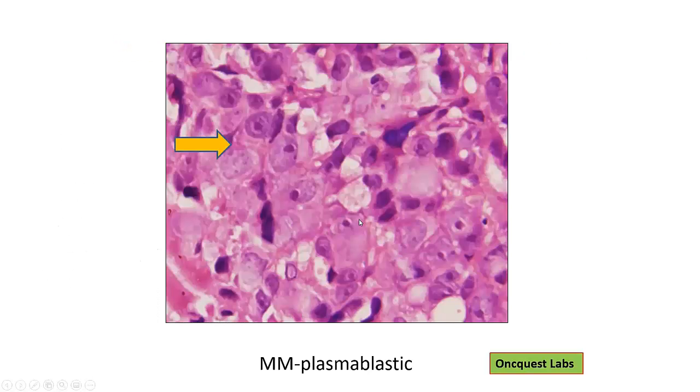Now this is the bone marrow biopsy. What I find on the bone marrow biopsy are large cells, number one. You can all see large cells, round to oval nuclei, and very, very prominent eosinophilic nucleoli were seen.